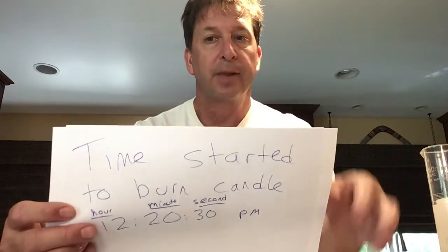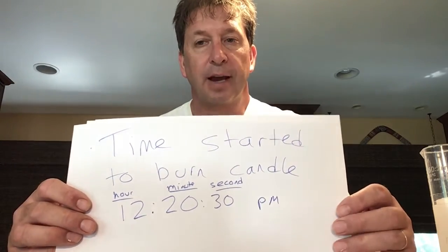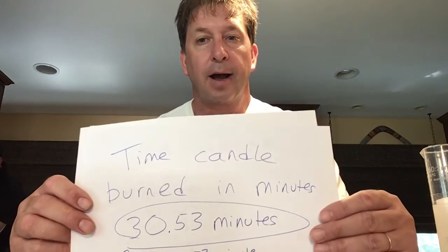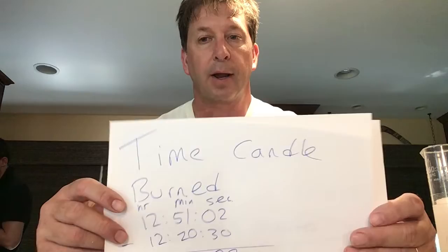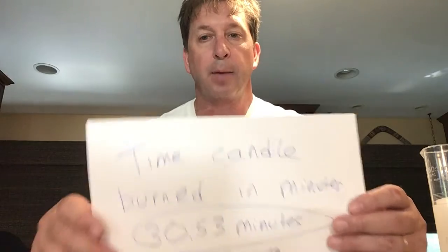The time we started the candle was here, to the nearest second. This was in the afternoon. This was the time we extinguished the candle. The difference between these two gives us the time that the candle actually burned. And then we would, of course, convert that to a decimal value before we do any calculations. So that is our data for the Candle Lab. Good luck on all the calculations.